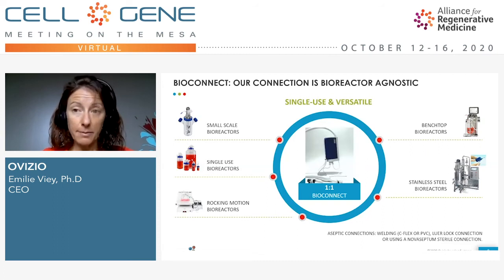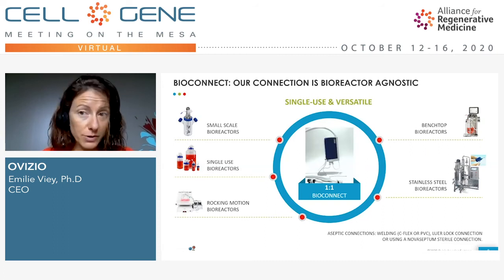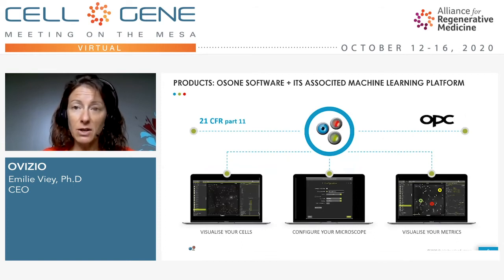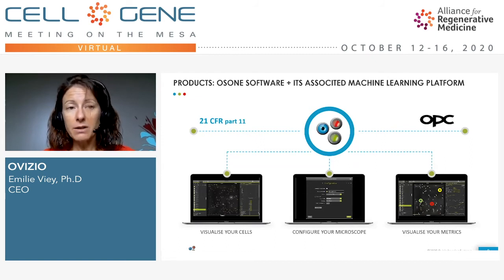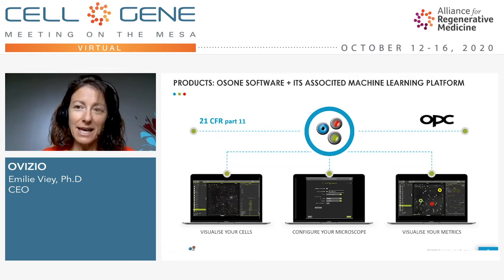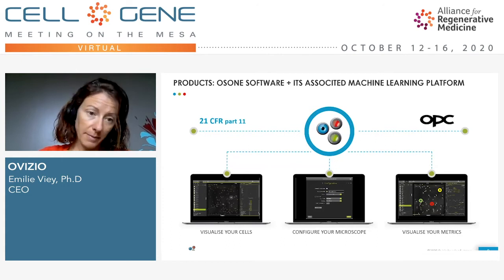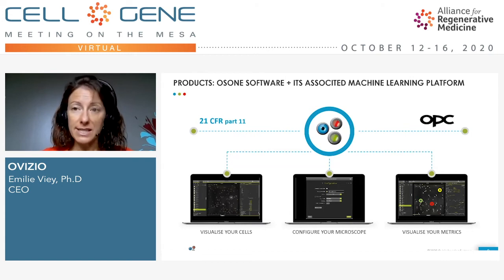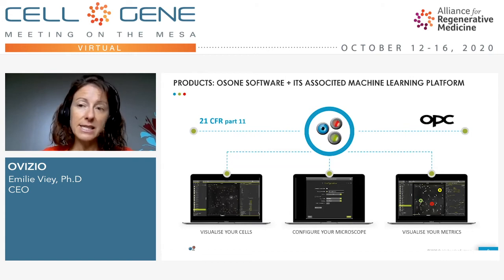On top of the QMOD camera and the AlignF microscope, we have the OS1 software and its associated machine learning platform. For the AlignF Pro, the software is 21 CFR Part 11 compliant since summer this year. With the same software, you can configure the microscope and camera, visualize the cells, and then visualize the metrics such as viability, total cell density, viable cell density, and much more.